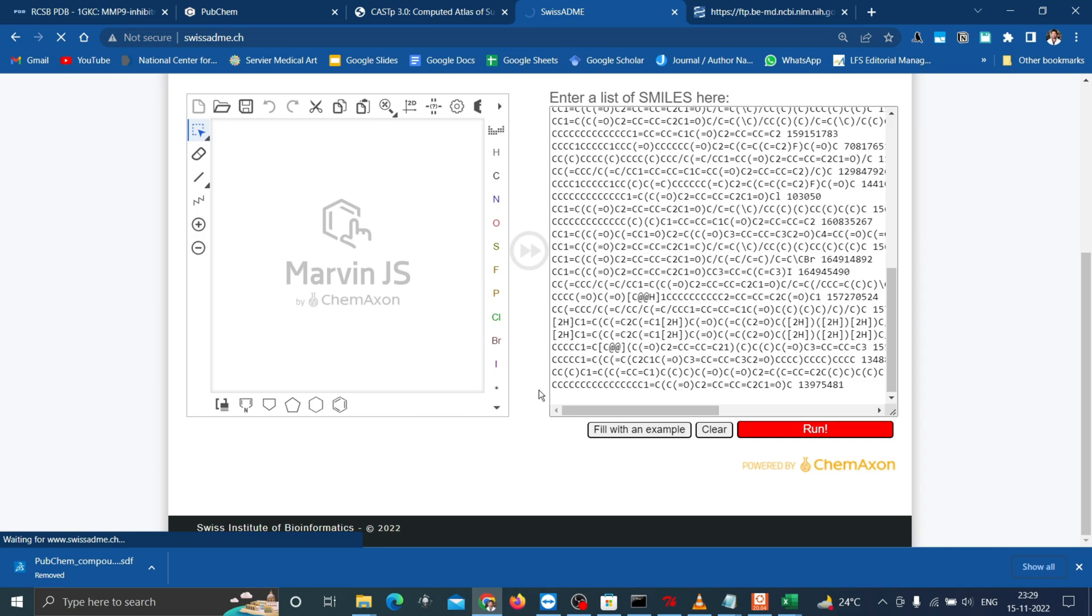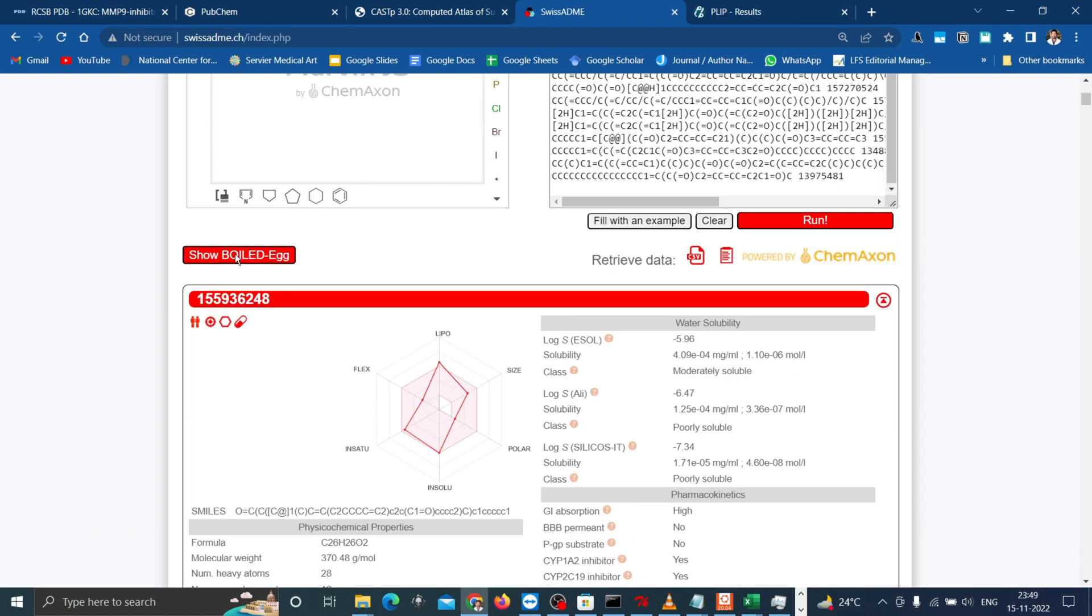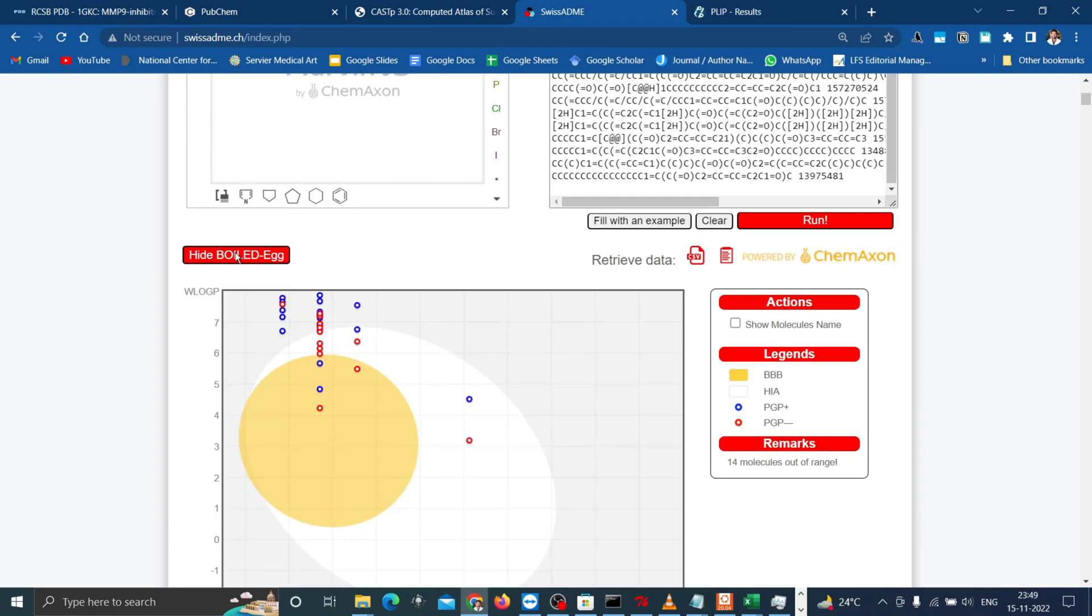This overall result is depicted as boiled egg here which directly predicts the passive diffusion through the intestinal absorption to blood-brain barrier permeation which are the main ADME behavior impacting pharmacokinetics. The points located in the white ellipse represent compounds with high probability to be passively absorbed by the gastrointestinal tract. The points in the yellow ellipse, that is the yolk, are for the compounds with high probability to permeate through the blood-brain barrier to access the CNS.